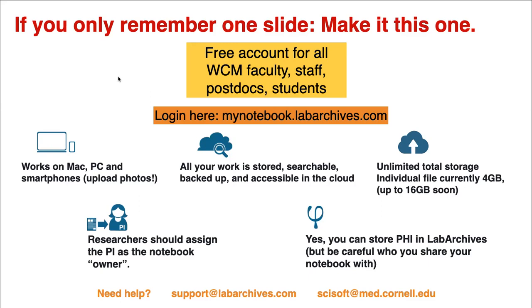And then all the work is stored in the cloud, is searchable, is backed up, and is accessible from everywhere. So you don't have to be in your lab. You can work from home.